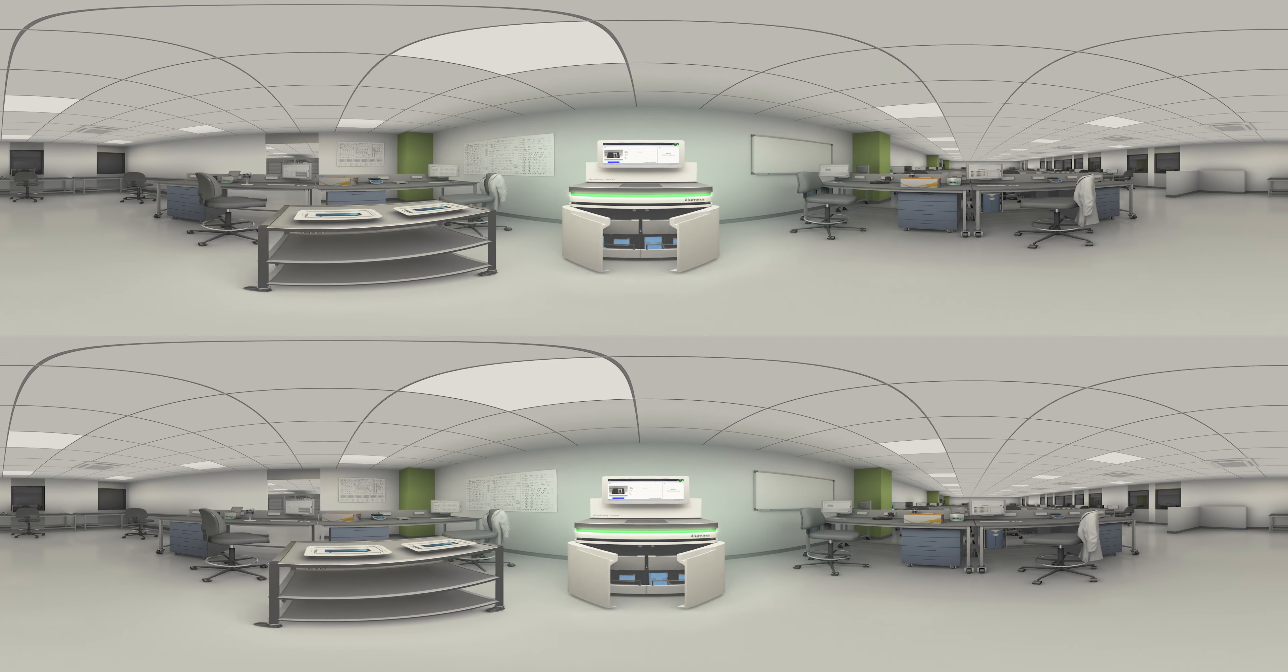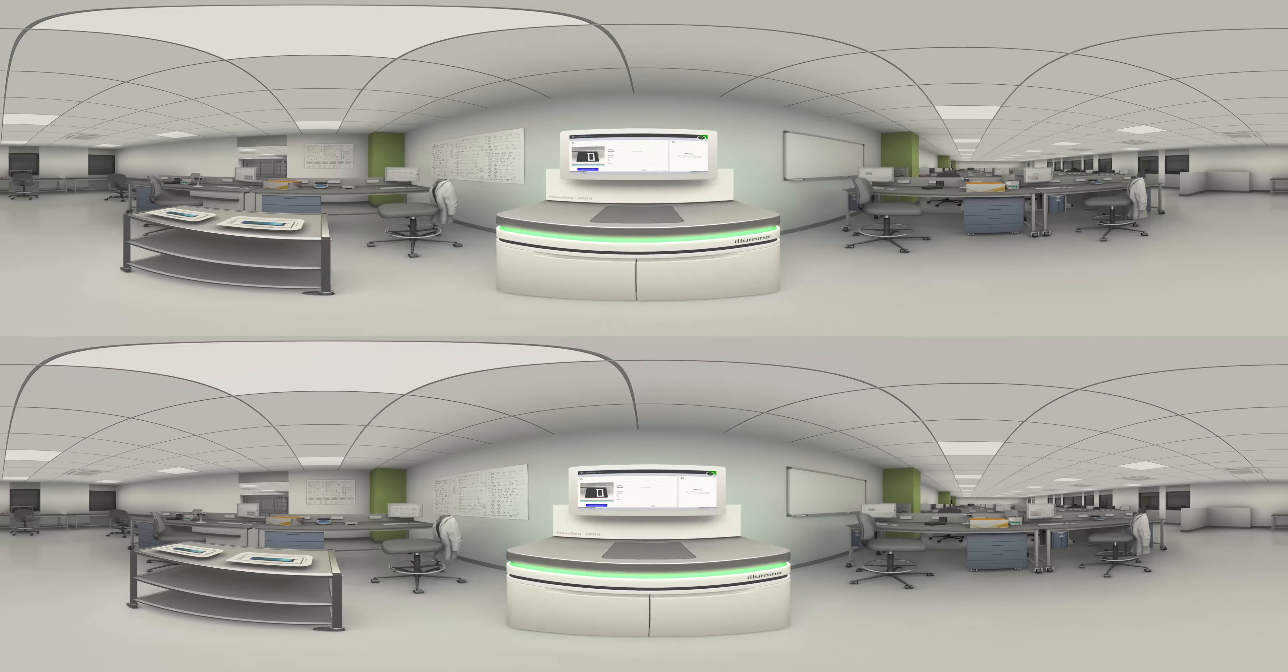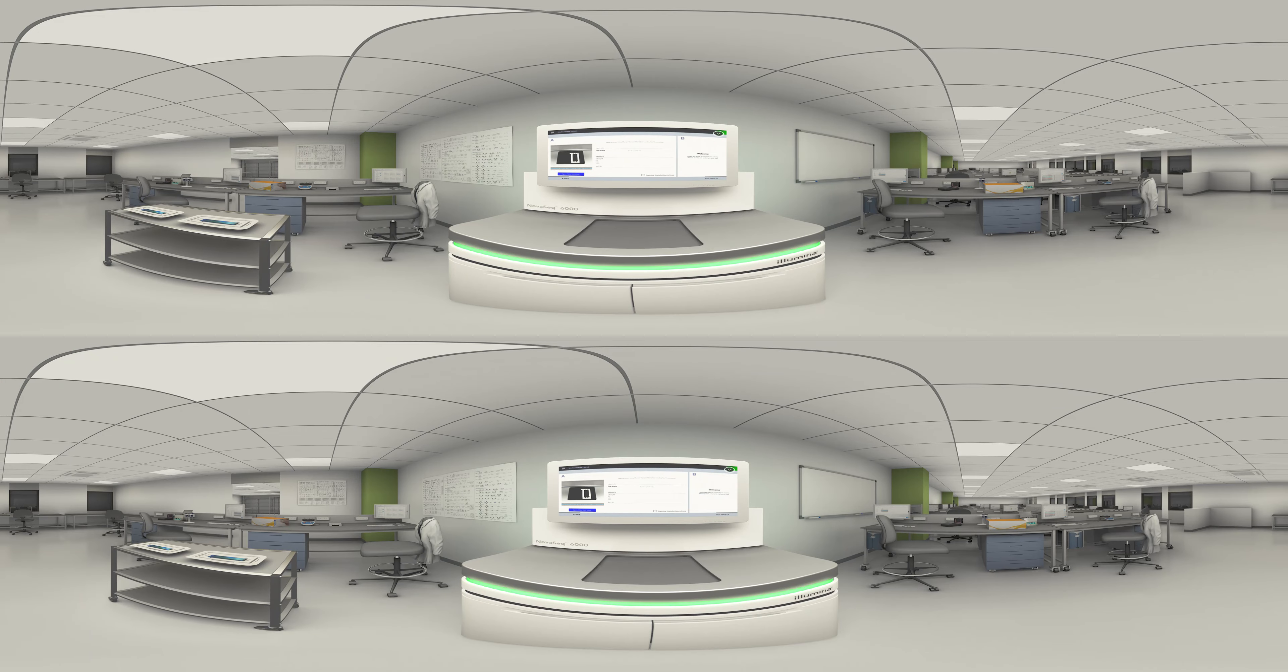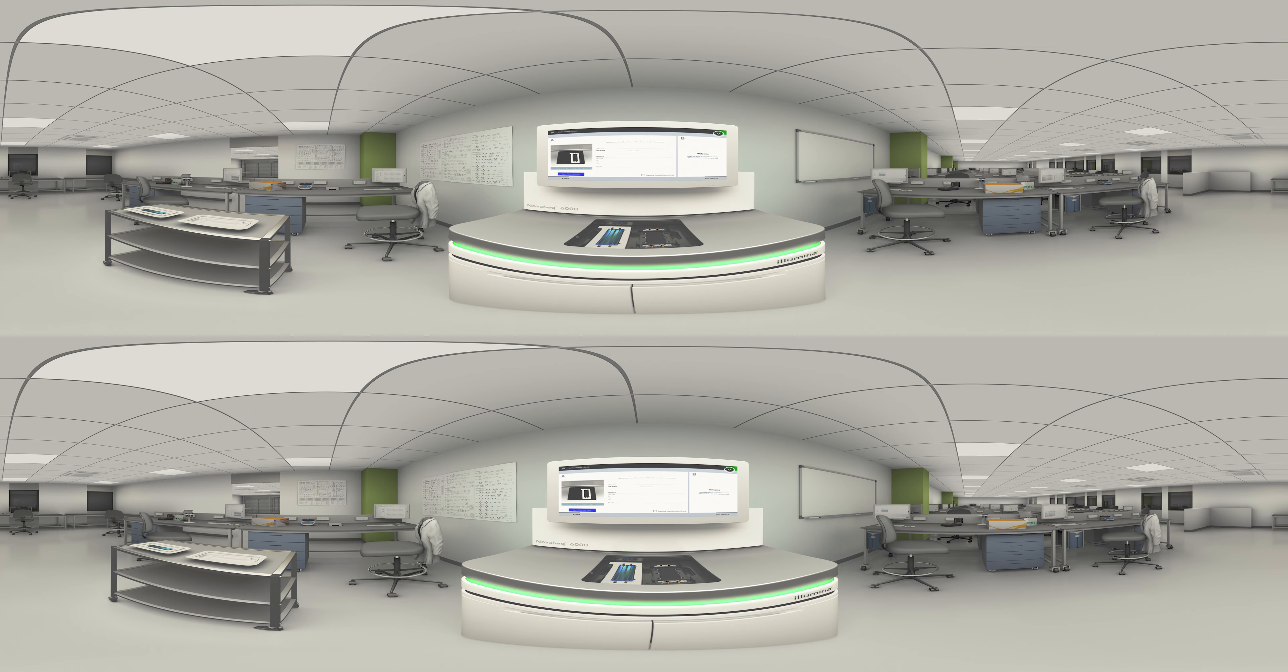Choosing from four flow cell types, sequencing output can be configured to match your application and project needs.